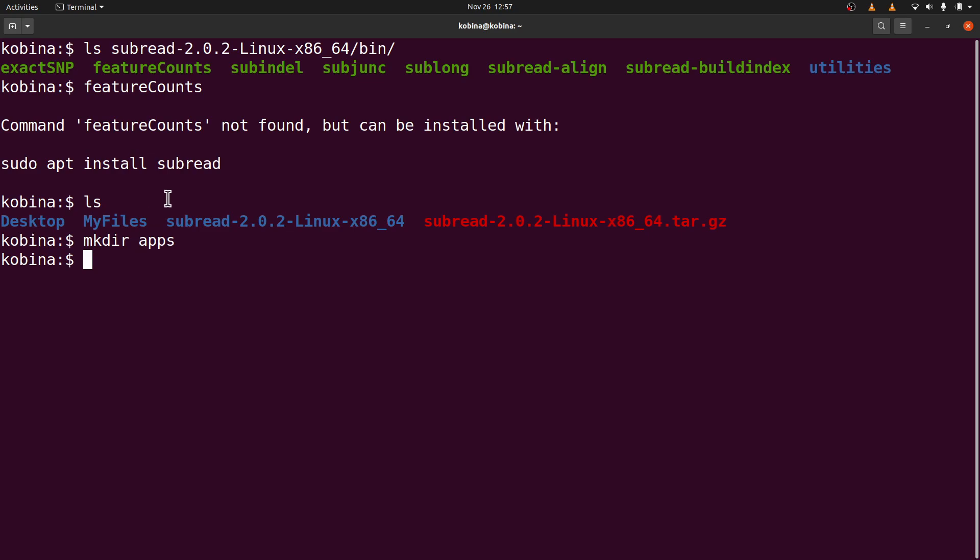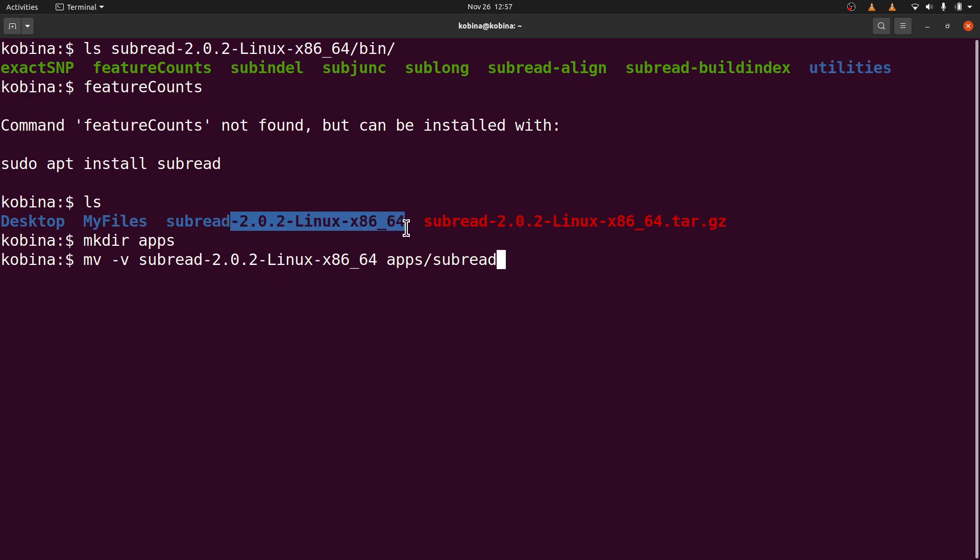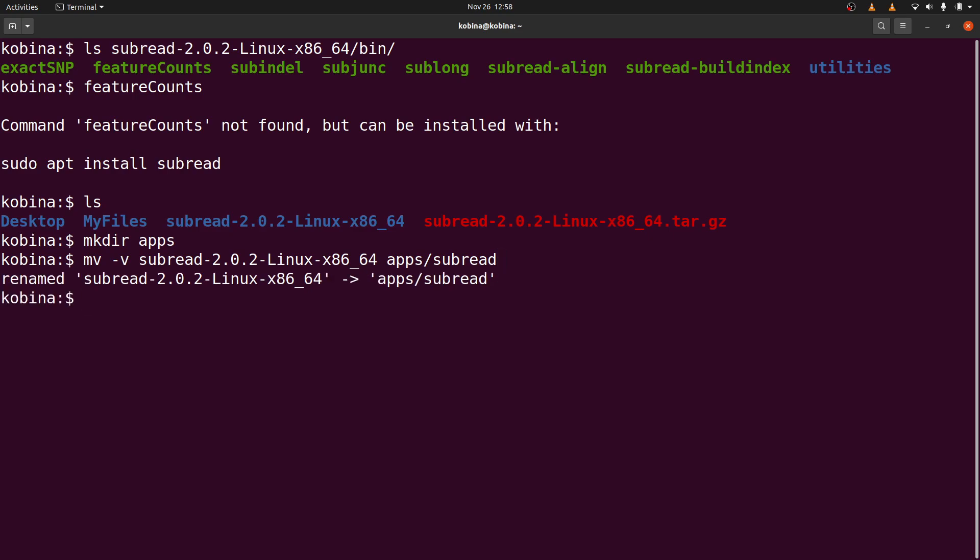I'll say mkdir apps. Then I'll move this subread to the directory. As I am moving, I'll also rename it. So I'll say mv, I'll say subread, then I'll move it to apps. I want to move all these other ones, but you can keep them there. That's fine. So I'll move this there.